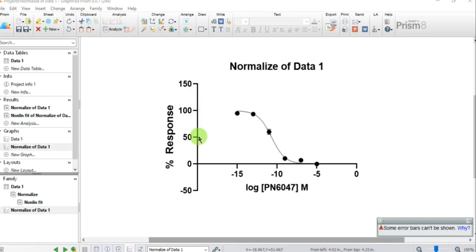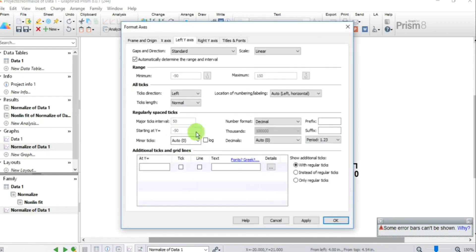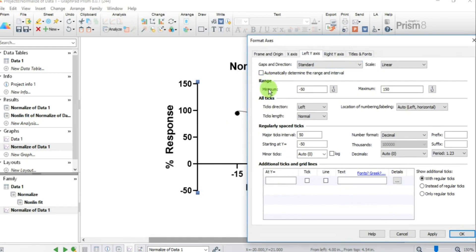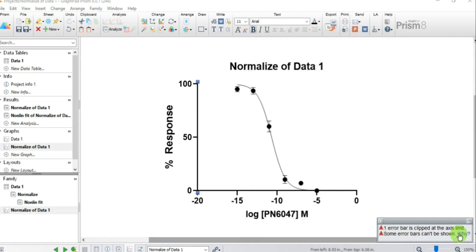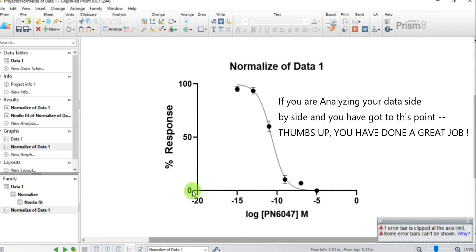The Y-axis is projecting too far downwards. Double-click the Y-axis and uncheck the automatic range box. The minimum is currently minus 50 — change it to 0. The maximum is 150 — change it to 100. The major tick interval of 50 is fine, and set minor ticks to zero. Now the Y-axis starts at 0 and shows 50% and 100% response.